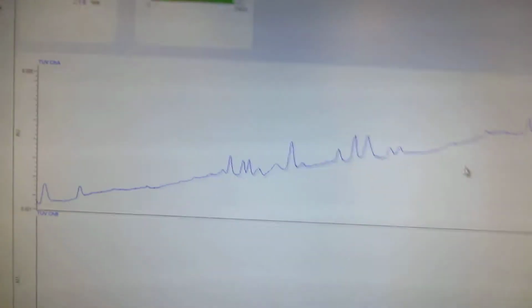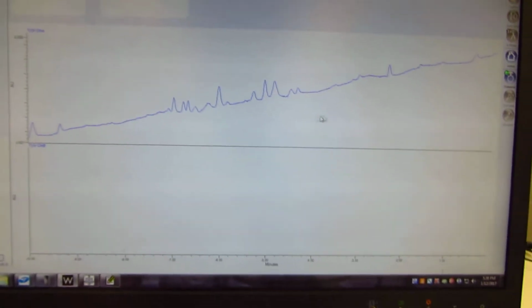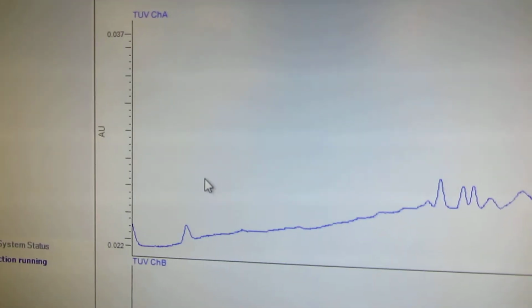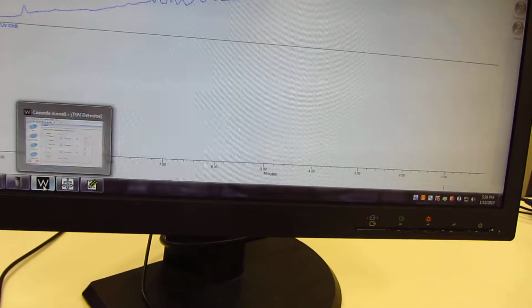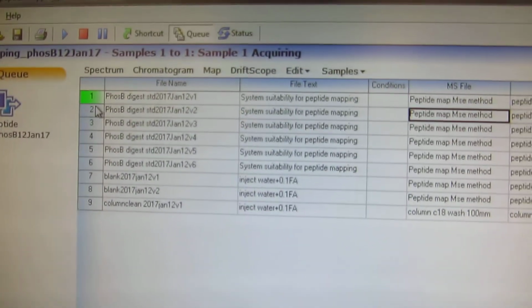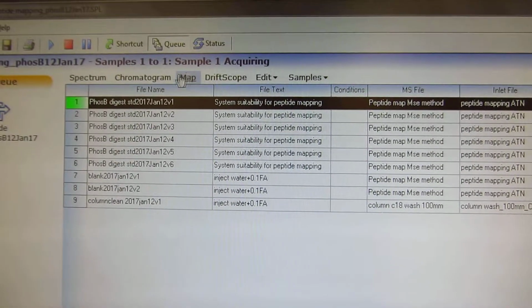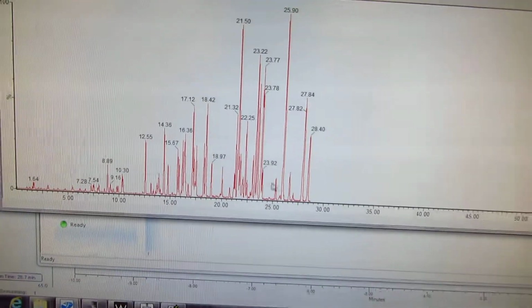That's our UV. Strangely, you can see an increase in the UV, but the scale is very small. It's illegible. Then let's go back to see what our chromatogram looks like at the moment. Let's check the one we're running. So that one, let's highlight it as chromatogram, and it pops out, and let's delete previously selected peaks. Chromatogram, so that's what it looks like with the BPI intensity of 4.6.